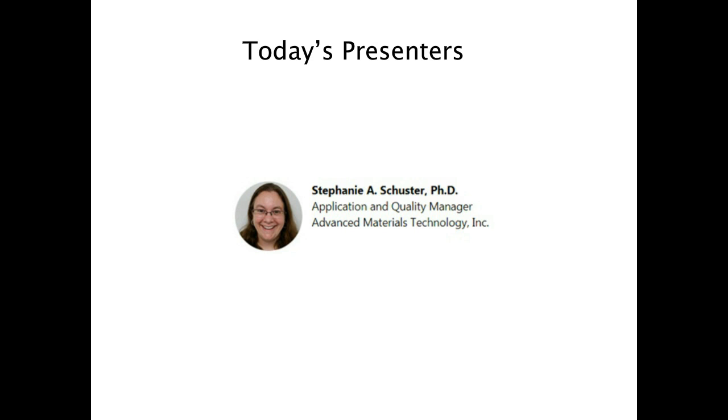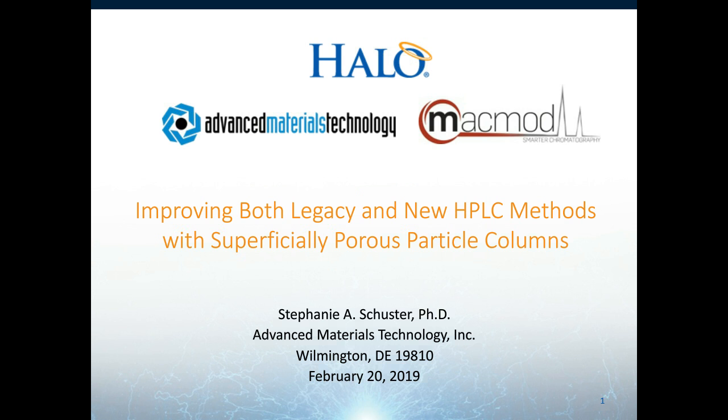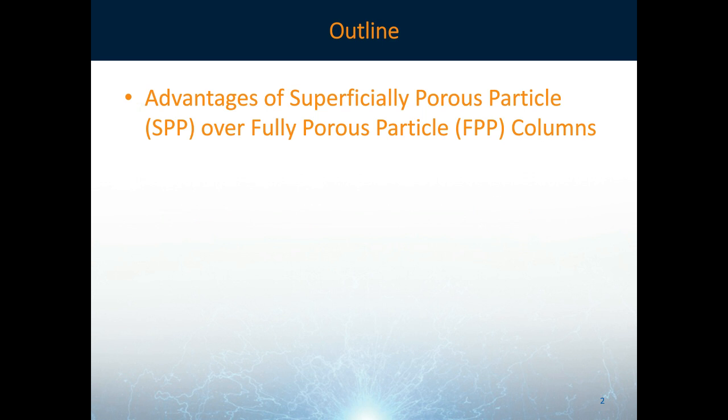Thank you, Laura, for the introduction, and thanks to all who are joining us today. So I'll be talking about improving both legacy and new HPLC methods with superficially porous particle columns. Here's a brief outline of my talk today. I'll go over the advantages of superficially porous particle, or SPP, columns over fully porous particle, or FPP, columns.